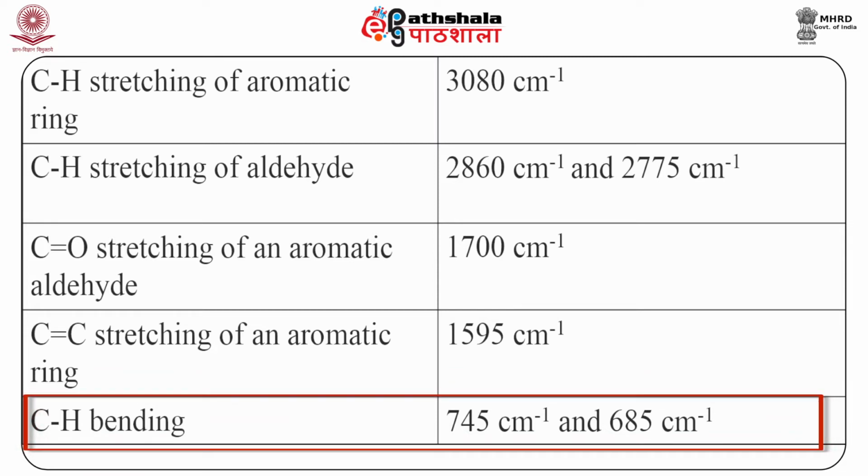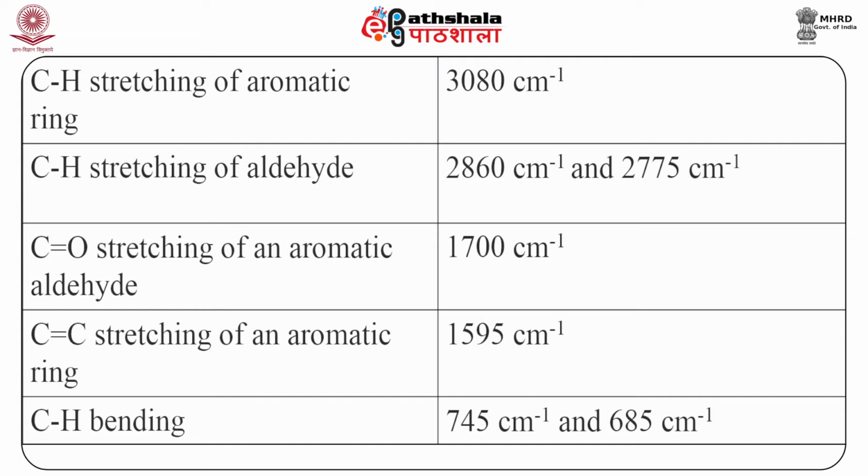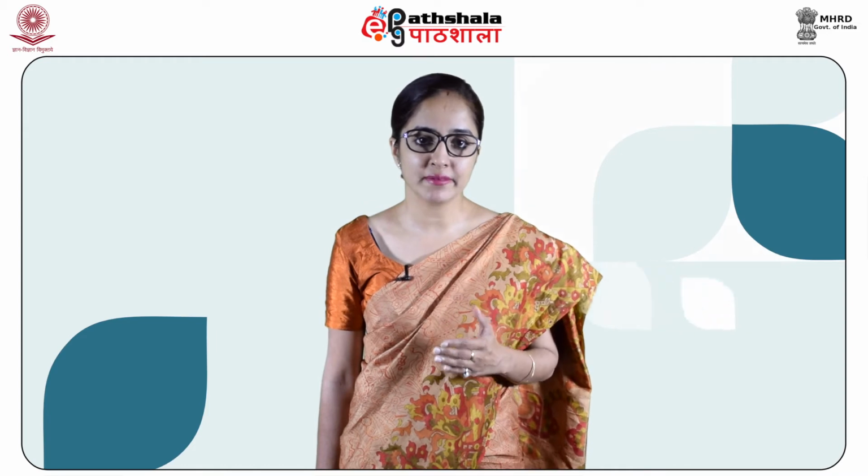No compound other than benzaldehyde can produce the same spectral details that I have mentioned above. That means if we have a reference spectrum for benzaldehyde and we take benzaldehyde and record its IR spectrum, and if the two spectra match with the above data that I have stated, then that spectrum definitely belongs to benzaldehyde and no other compound.